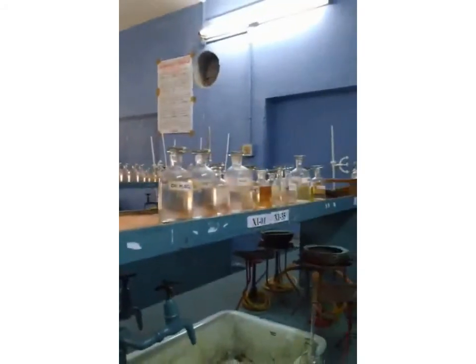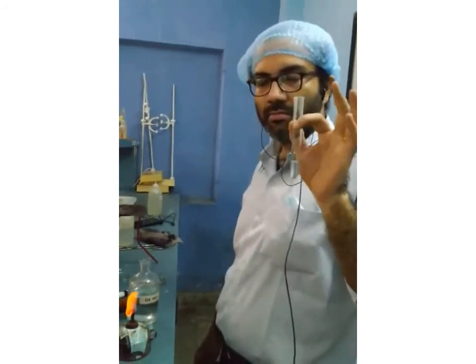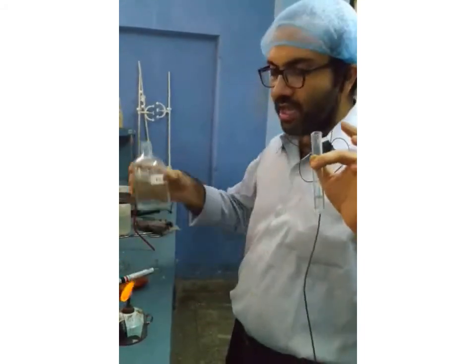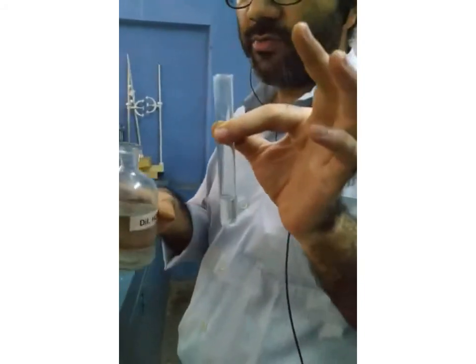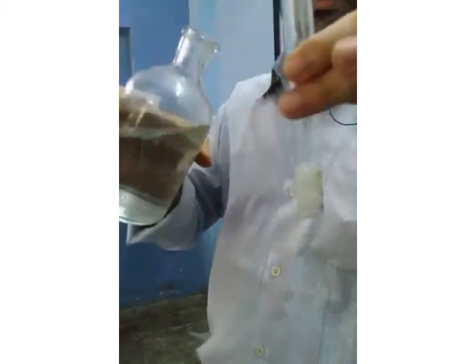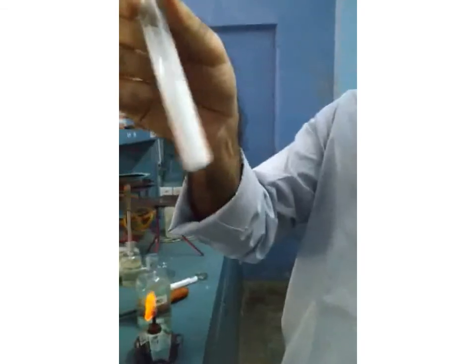And if this lead ion is present, I am saying that I have taken lead salt. But how can I prove that this is lead salt? If lead salt is present, then definitely when I pour this acid, you will get some precipitates. The color of the precipitate has to be white. Let's check it out. You can see a white colored precipitate has formed, a dense, thick white precipitate.